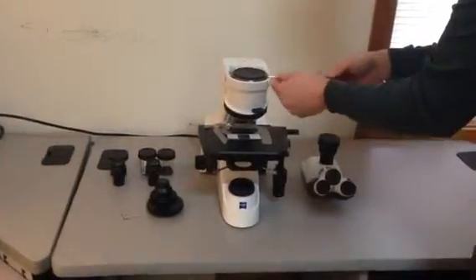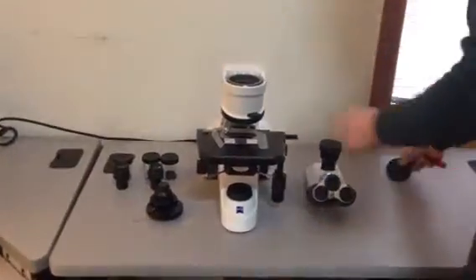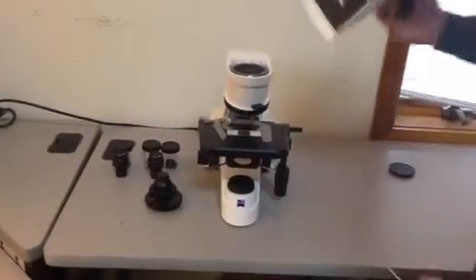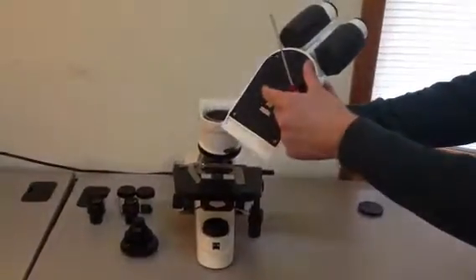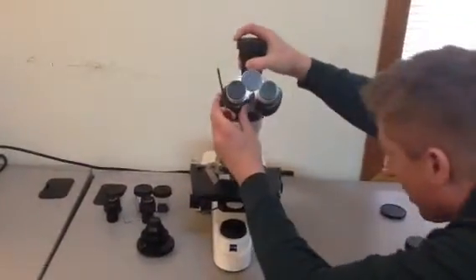Take the Allen wrench and back this set screw out, then remove the dust plug. Just make sure it's backed all the way out so the dovetail is free. Then you can take your microscope head, pull the dust cover off the bottom, and just set it right on there.